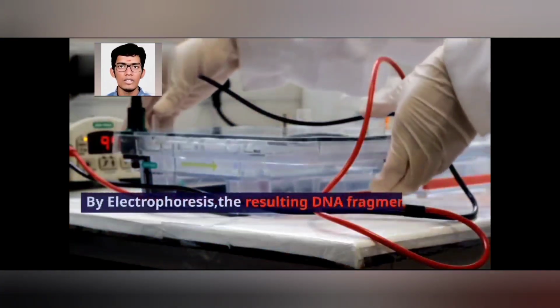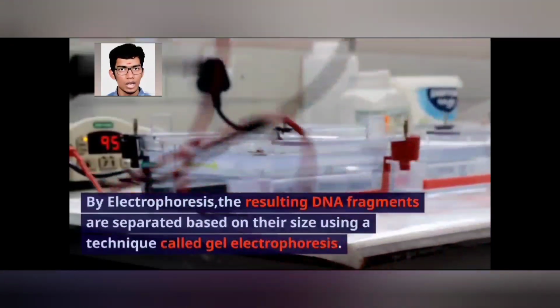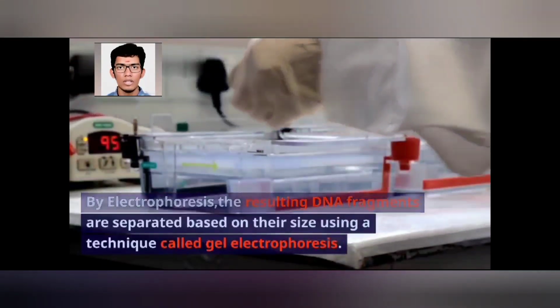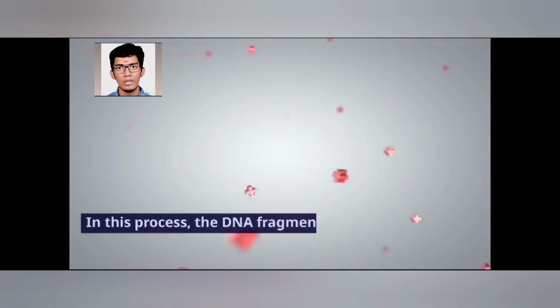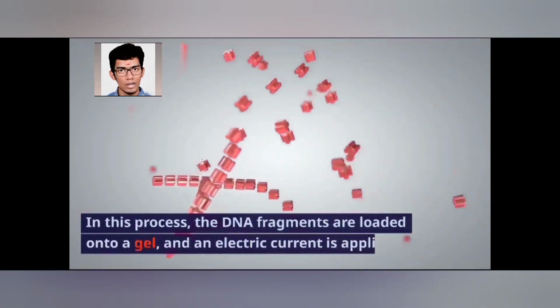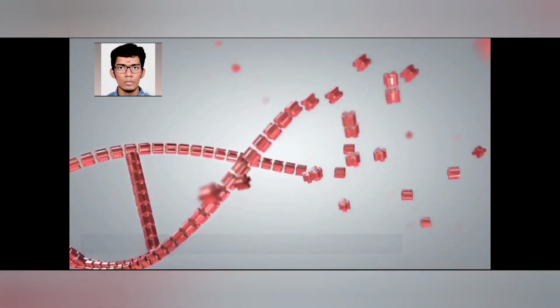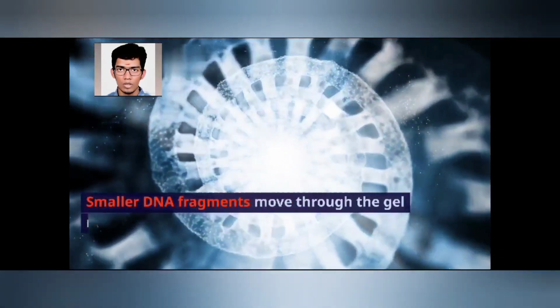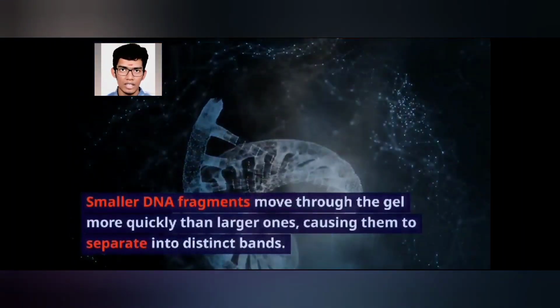Next is electrophoresis. The resulting DNA fragments are separated based on their size using a technique called gel electrophoresis. In this process, the DNA fragments are loaded onto a gel, and an electric current is applied. Smaller DNA fragments move through the gel more quickly than larger ones, causing them to separate into distinct bands.